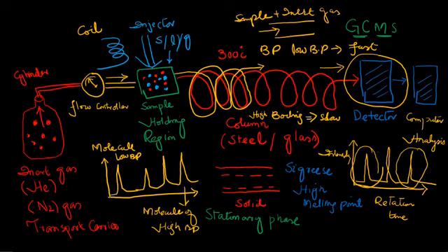Just keep in mind, it is not necessary that gas chromatography collects information only on the basis of boiling point. Suppose we have molecules with the same boiling point, then how can we get information from the gas chromatograph about what type of molecules these are? Dear student, please note that every molecule has an atomic weight. Some molecules are small, some are big.